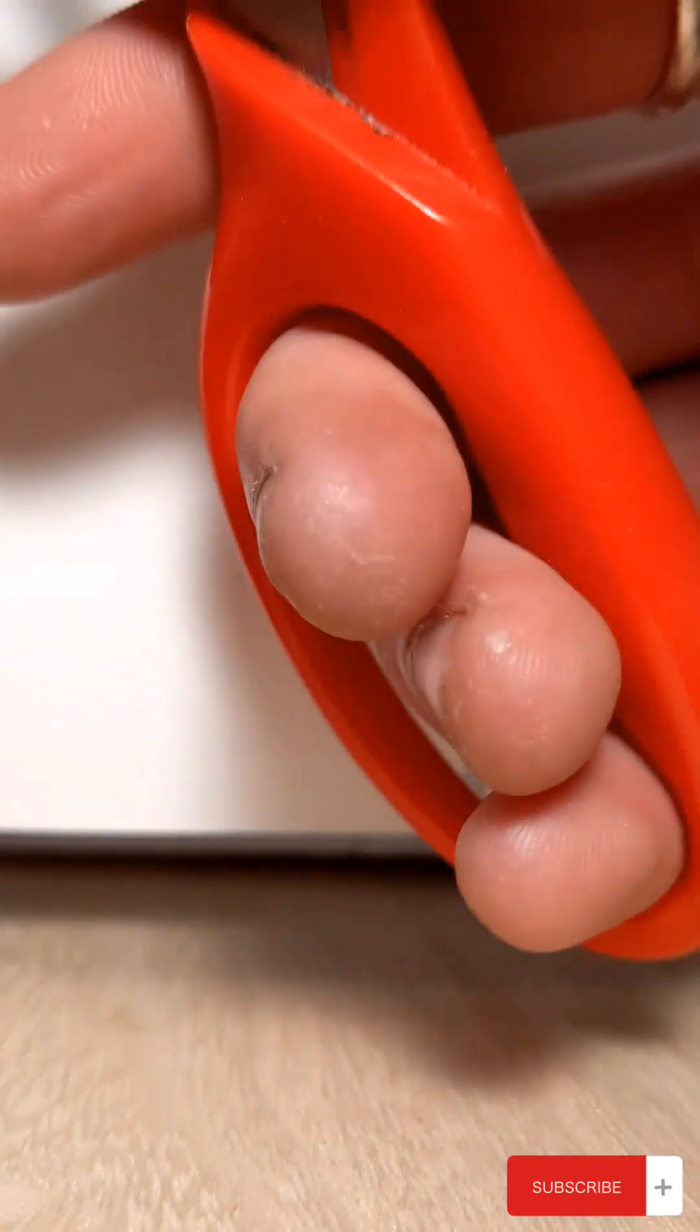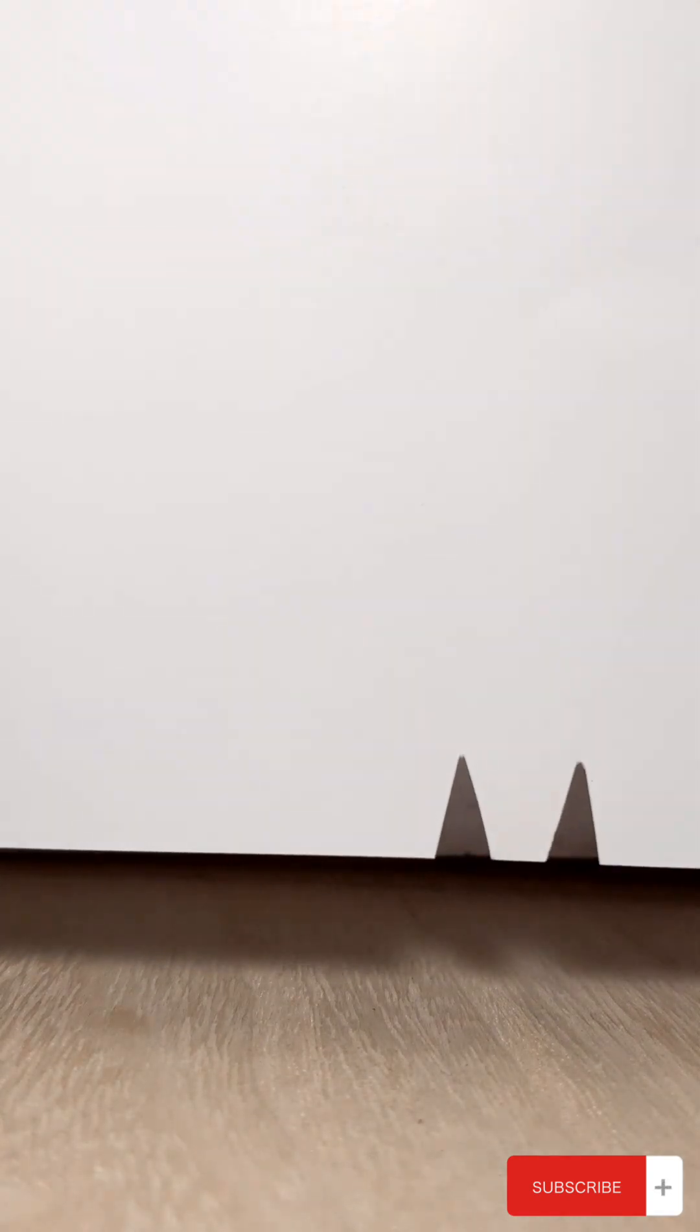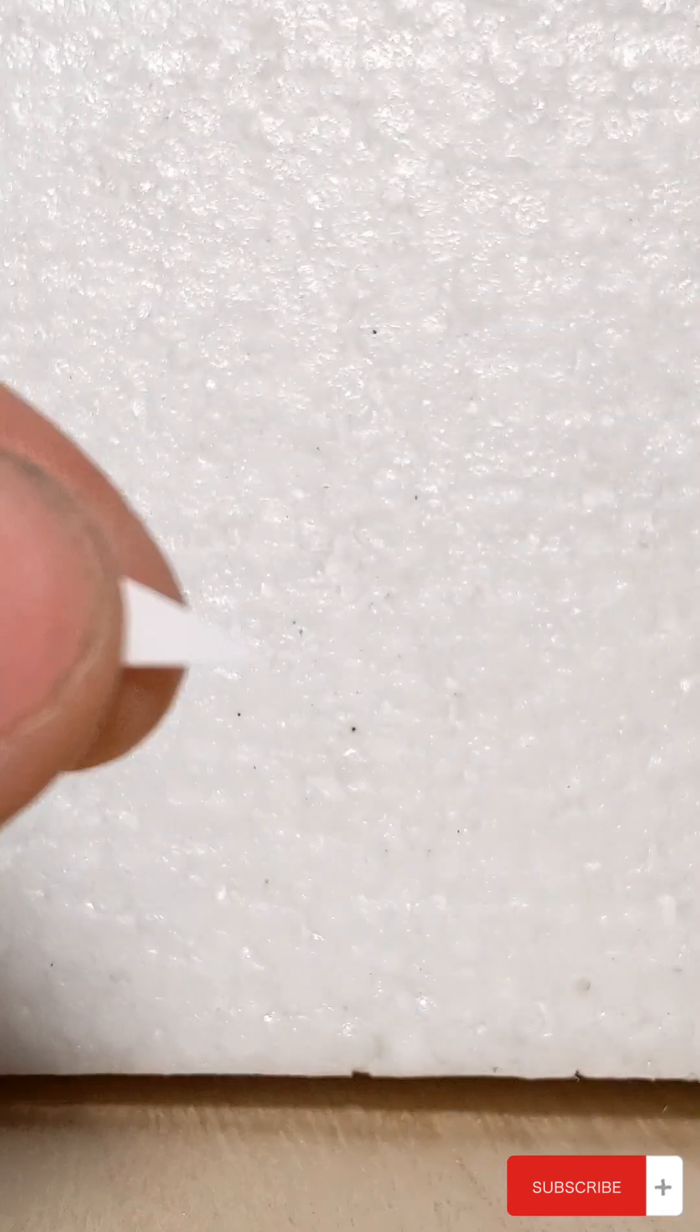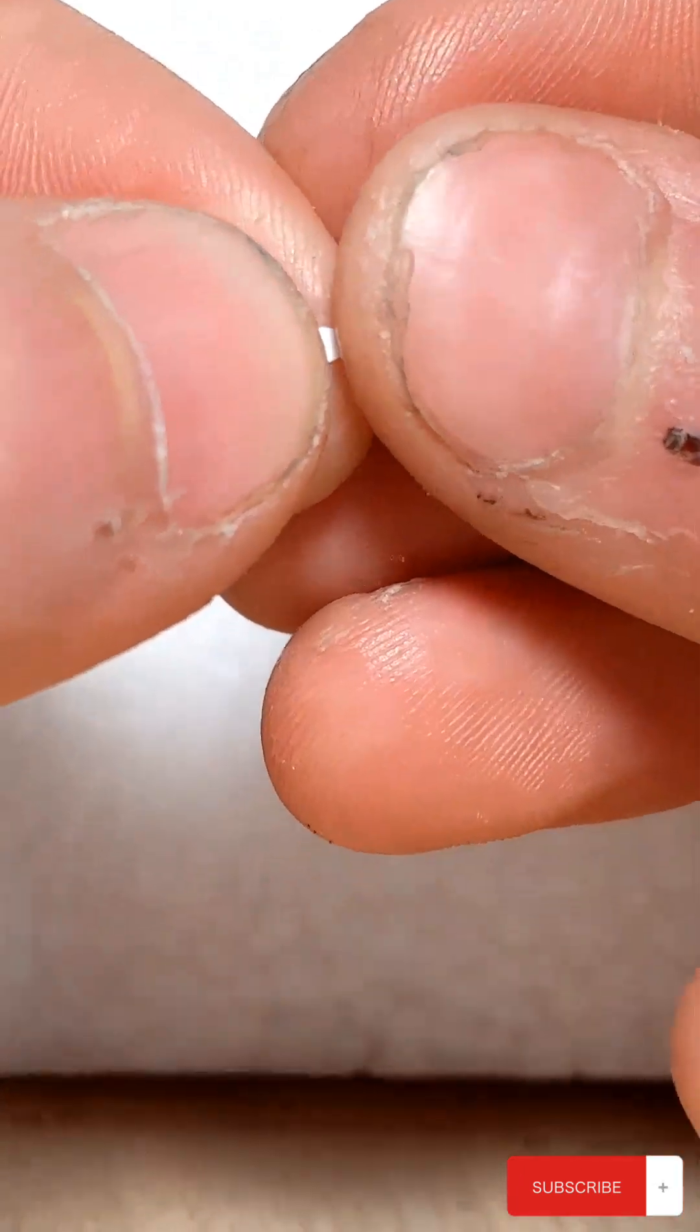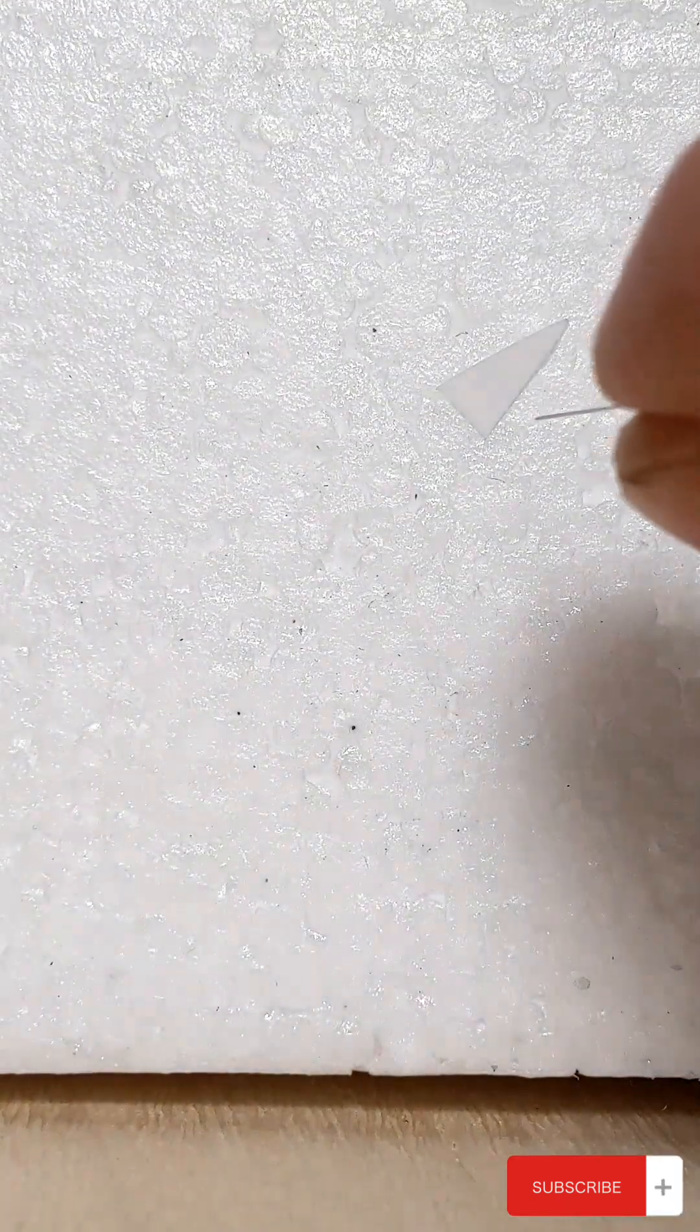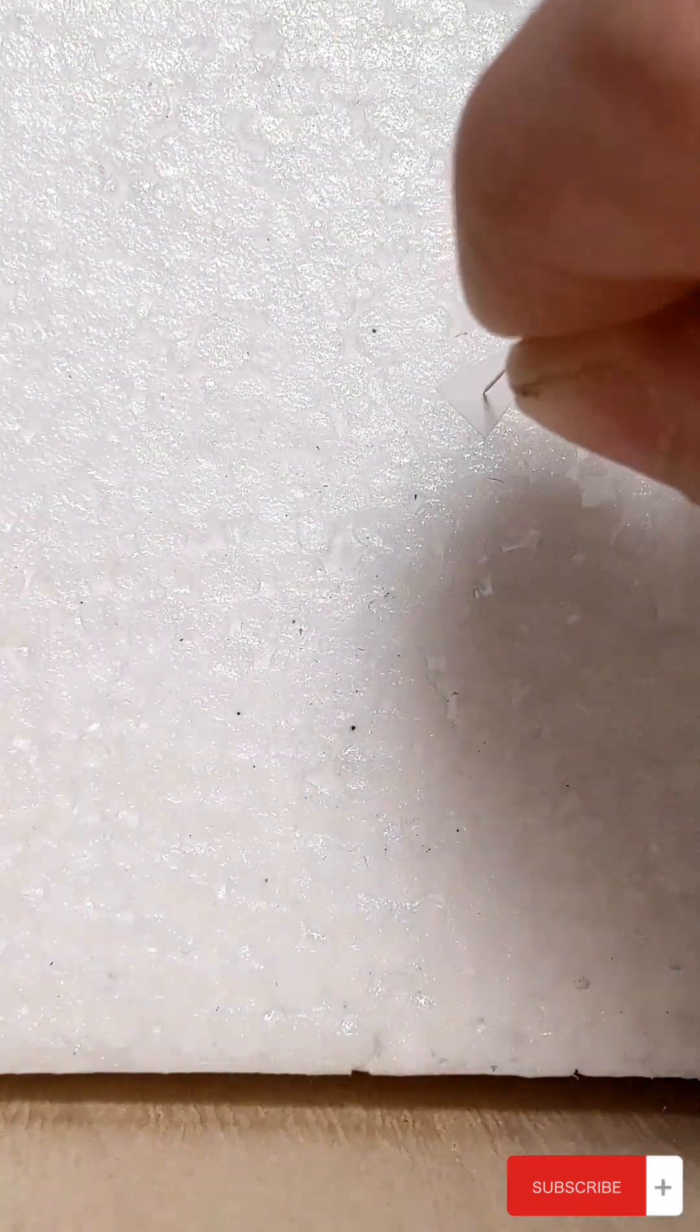I don't have a punch but I do have just some normal scissors so I went and cut two identical little triangles. You're going to bend the tip of the triangle and then you're going to get your size two pin and you're going to pin through the center of that.